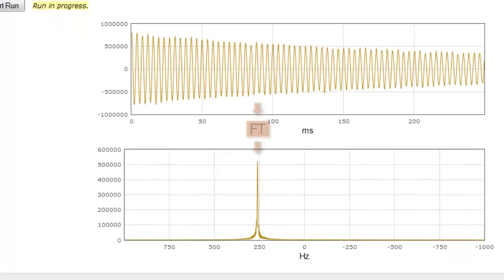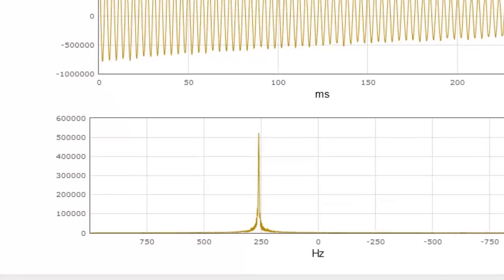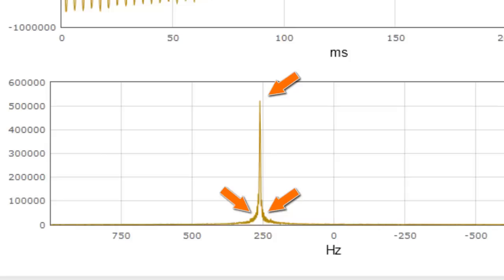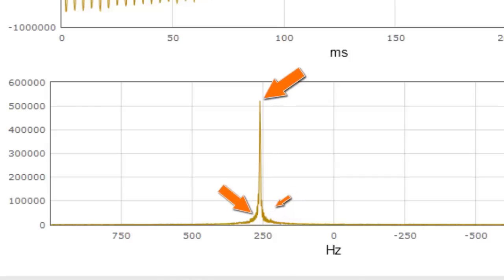A Fourier transform of the complex data produces a spectrum of our signal in the frequency domain. When monitoring our spectrum, we look for symmetry in our signal, as well as intensity. Signal resolution is determined by many factors, both instrumental and chemical. And when shimming, we improve our signal resolution and sensitivity by maximizing the intensity and minimizing the asymmetry of our signal.